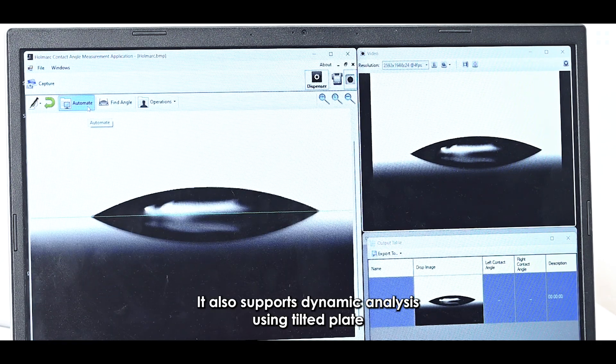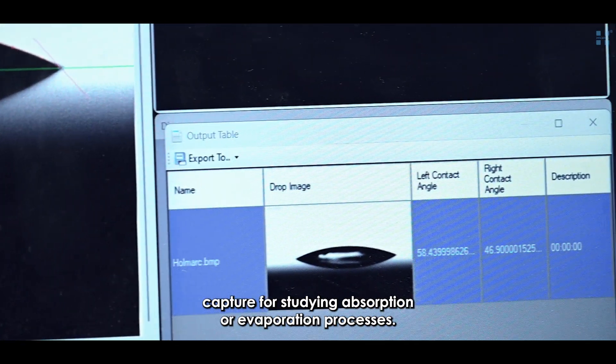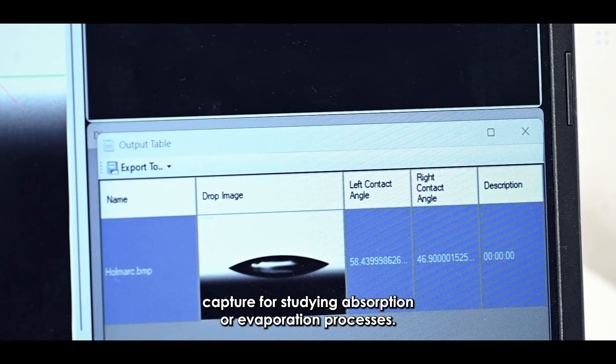It also supports dynamic analysis using tilted plate and needle dosing methods, along with time-lapse video capture for studying absorption or evaporation processes.